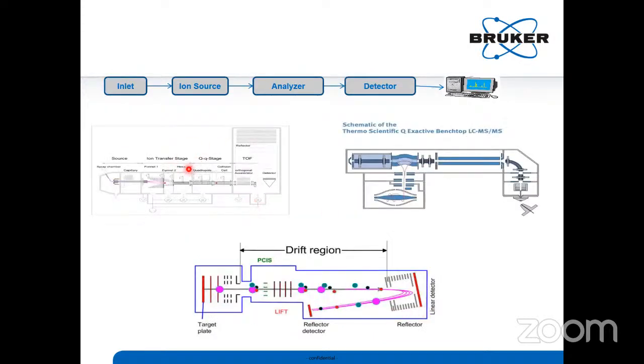Q-TOF technology. What is the difference between Q-TOF and triple quad? Only the analyzer part will change. Instead of the third quadrupole, here you will have TOF technology. The same as you can see here: spray chamber. Your sample is injected through the spray chamber. The glass capillary passes the charged ions. Through the funnel, it will go to the hexapole, where it is made into an ion path.